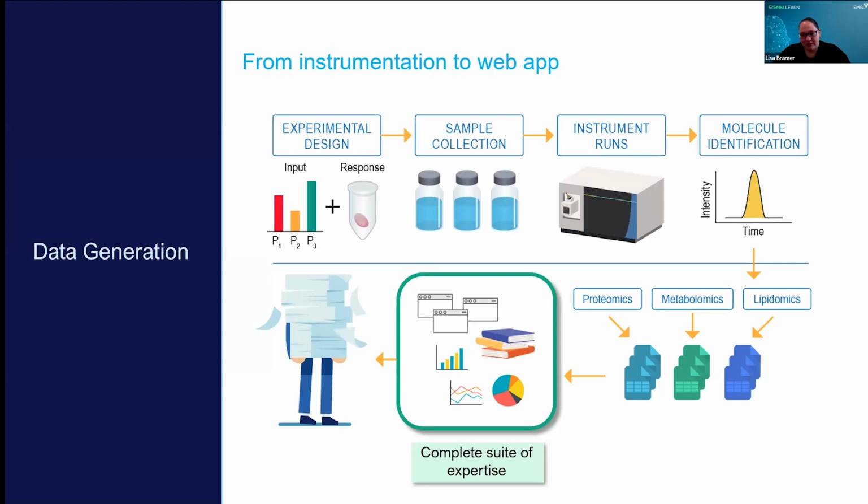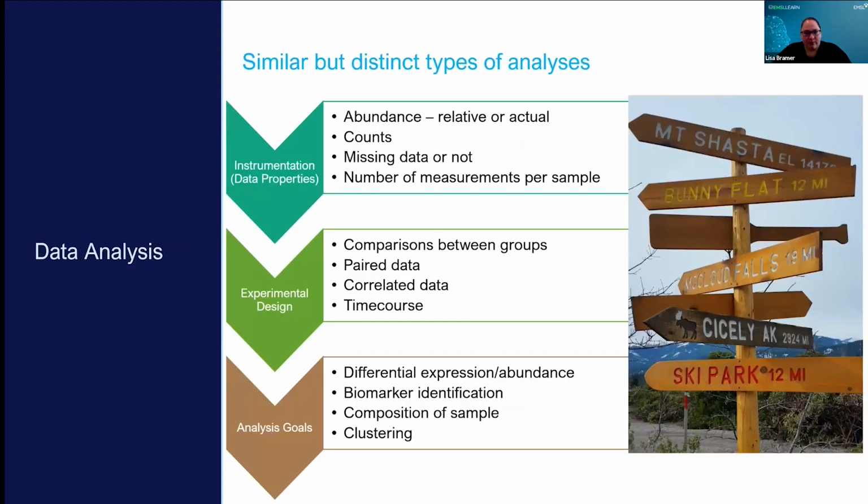So our goal is for you all to get your hands on your data as soon as possible and remove some of these barriers, particularly the coding and having to know exactly what statistical methods are appropriate when. And we proposed to do that using this Multiomics Analysis Portal.